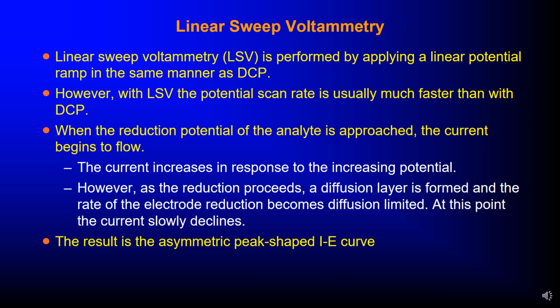So we will start with linear sweep voltammetry. It is performed by applying a linear potential ramp in the same manner as direct current polarography.